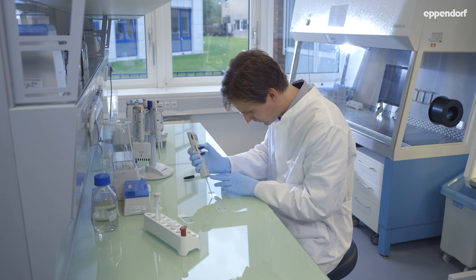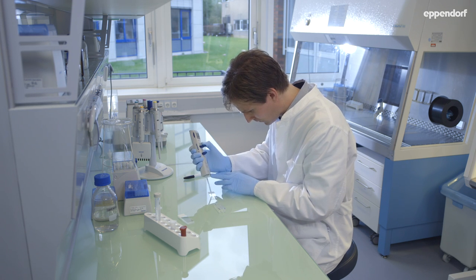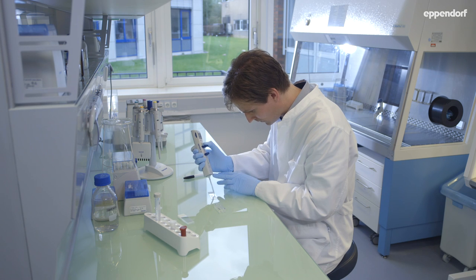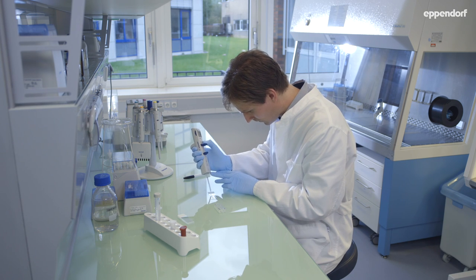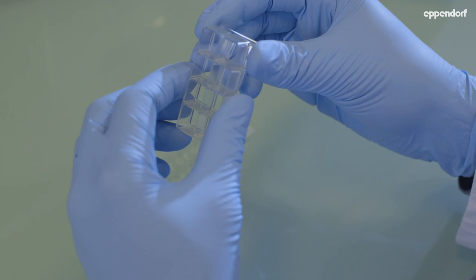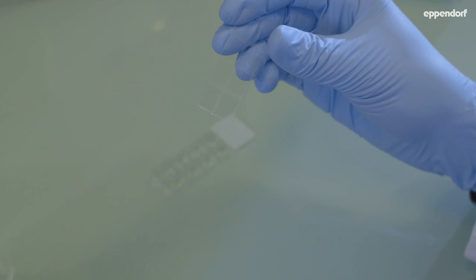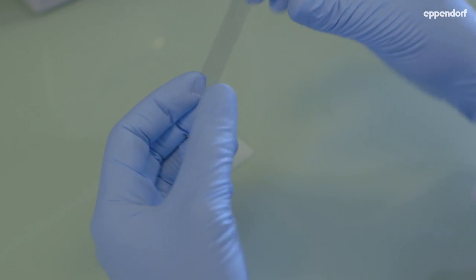Cells grown on the Eppendorf cell imaging cover glass can be mounted by using a standard microscope slide. Carefully remove the chamber from the thin cover glass and place it on the microscope slide.